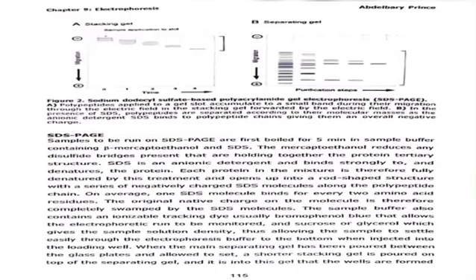There is only a small quantity of protein-SDS complex, so they concentrate in a very tight band between the glycinate and the chloride ion boundaries. Once the glycinate reaches the separating gel, it becomes more fully ionized in the higher pH environment and its mobility increases. The pH of the stacking gel is 6.8 and that of the separating gel is 8.8. Thus, the interface between glycinate and the chloride ions leaves behind the protein-SDS complex, which are left to electrophorese at their own rates. Figure 2.